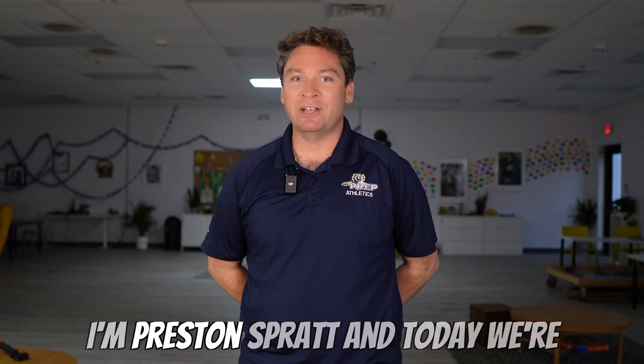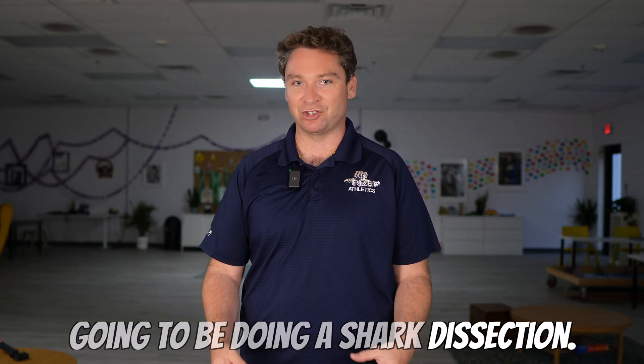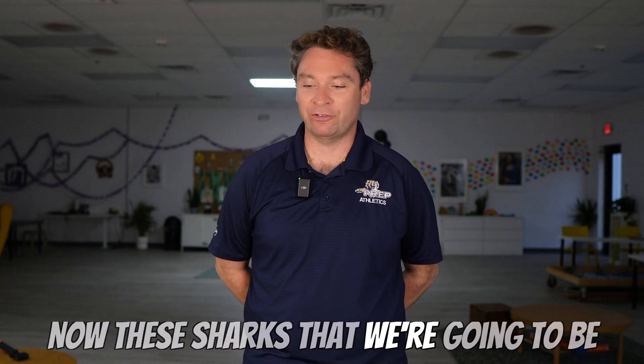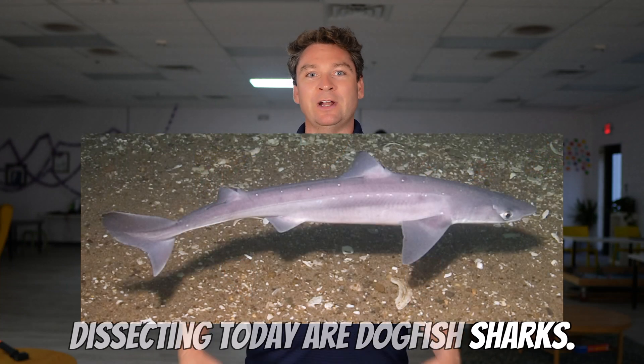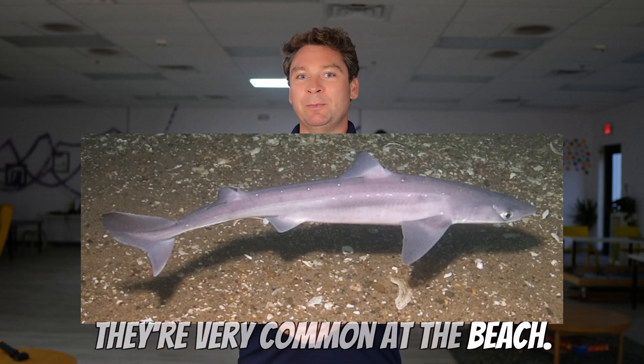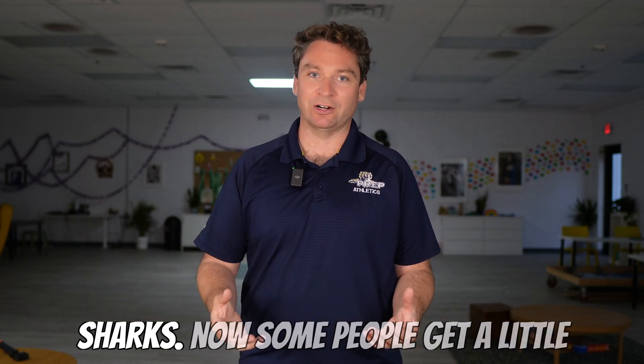Welcome to Sprattronics Learning Lab. I'm Preston Spratt, and today we're going to be doing a shark dissection. These sharks that we're going to be dissecting today are dogfish sharks. They're very common at the beach. They're typically fairly small, but we're going to learn so much from these sharks.